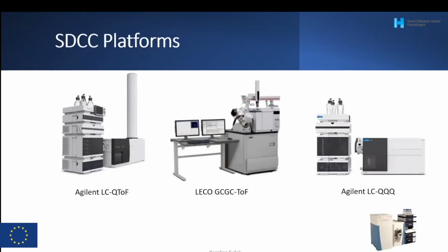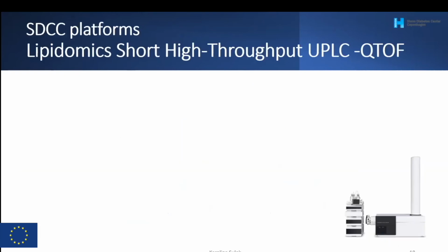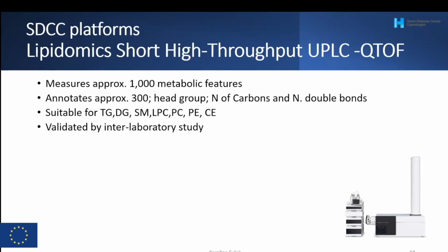At SDCC, we have different types of platforms, and for Galaxy and MicrobLiver, those three I'm sure you are very familiar with. We are currently working on setting up another type of platform that will be used mainly for super fast, super short methods for many thousands of samples. These are our strong working machines.